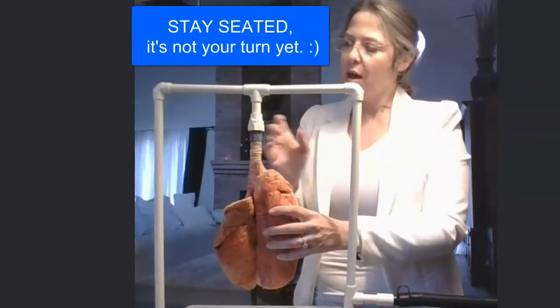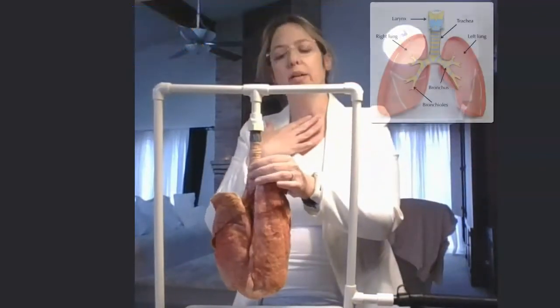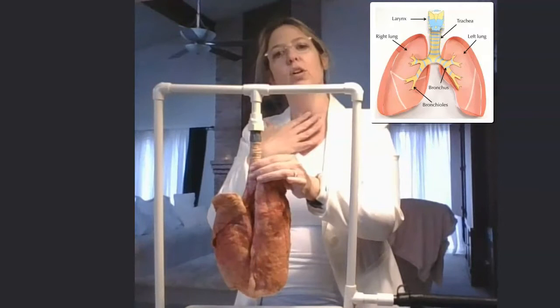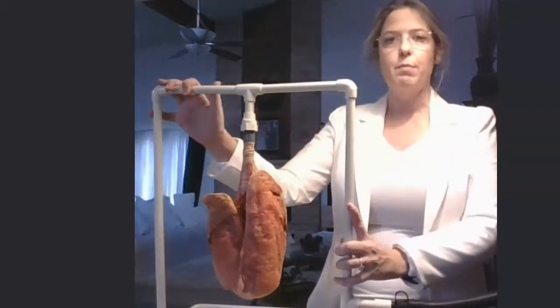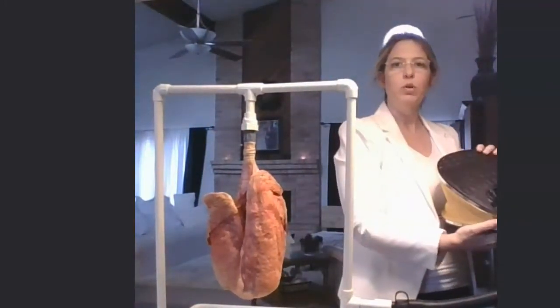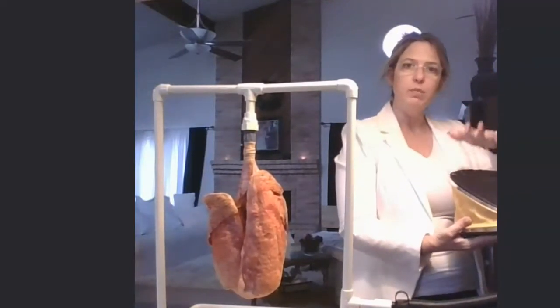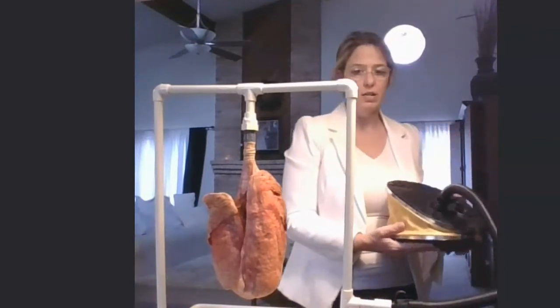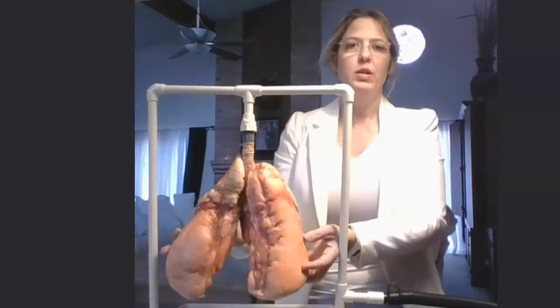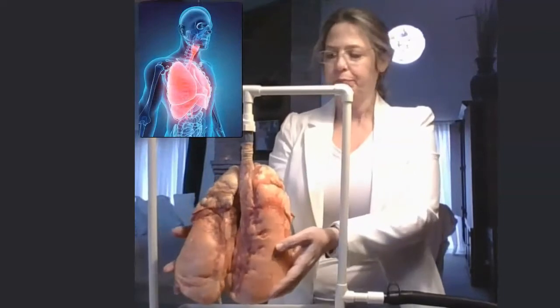You will come up and you can feel the bumps, comparing them to your own bumps in your trachea or windpipe. The lungs are set up on this apparatus that is attached to a floor pump. This will be on the floor, and this is for you to, with your foot, press 3 times and 3 times only to inflate the lungs. When you press 1, 2, 3, you will see how big the lungs inflate.